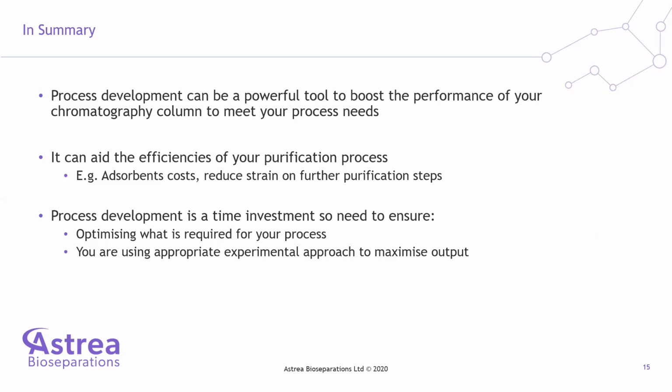So, in summary, process development can be a powerful tool to boost the performance of your chromatography column run in order to make it meet your needs. It can also be used to aid the efficiencies of your purification process. For example, it can help reduce your adsorbent costs, or it can help reduce the strain on your further process purification steps if you needed smaller volumes to work with, or if you just needed to improve the purity to make it easier to reach your final goal purity.